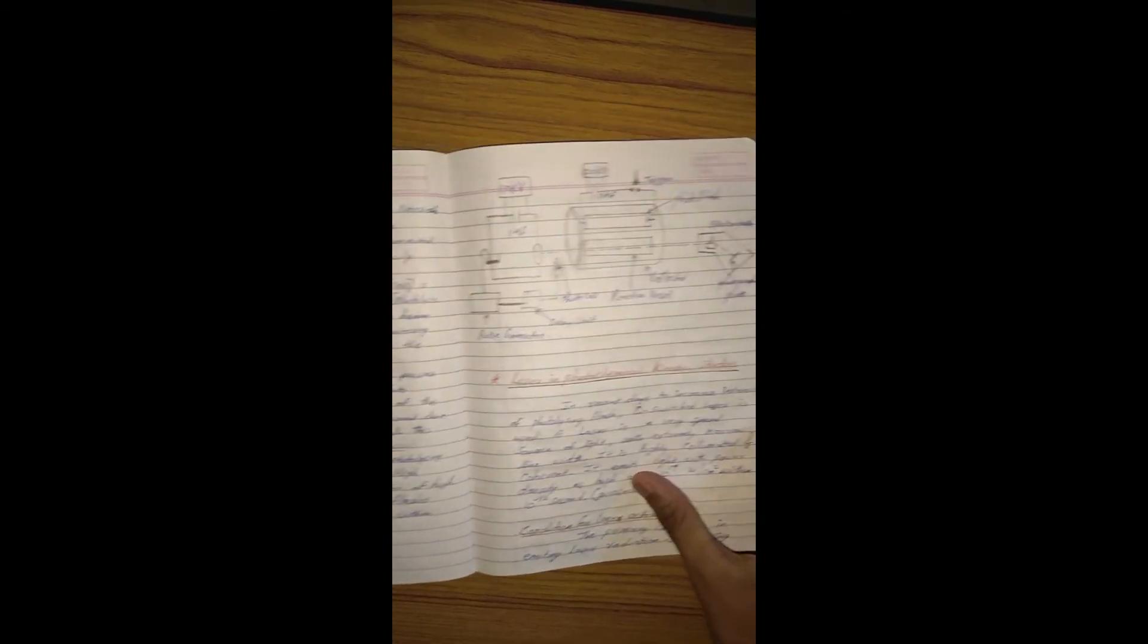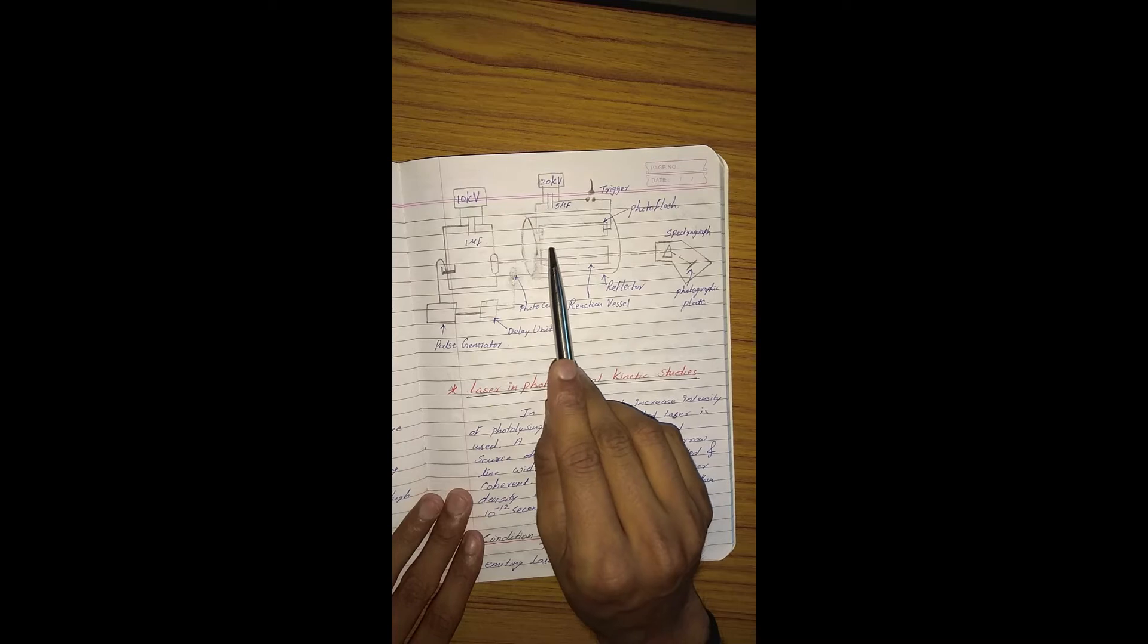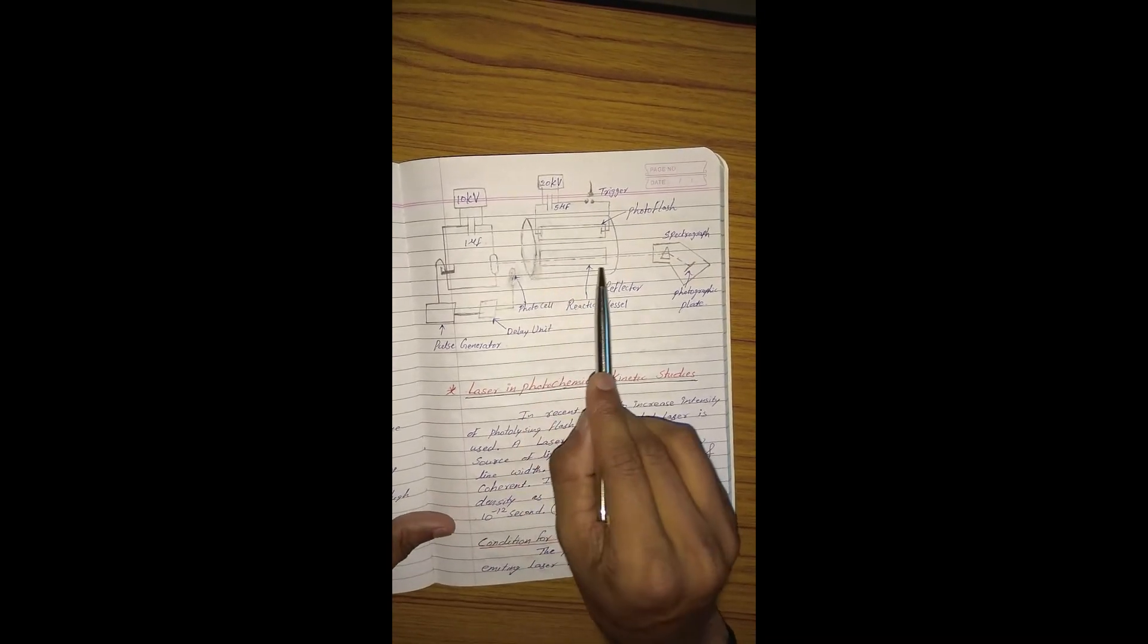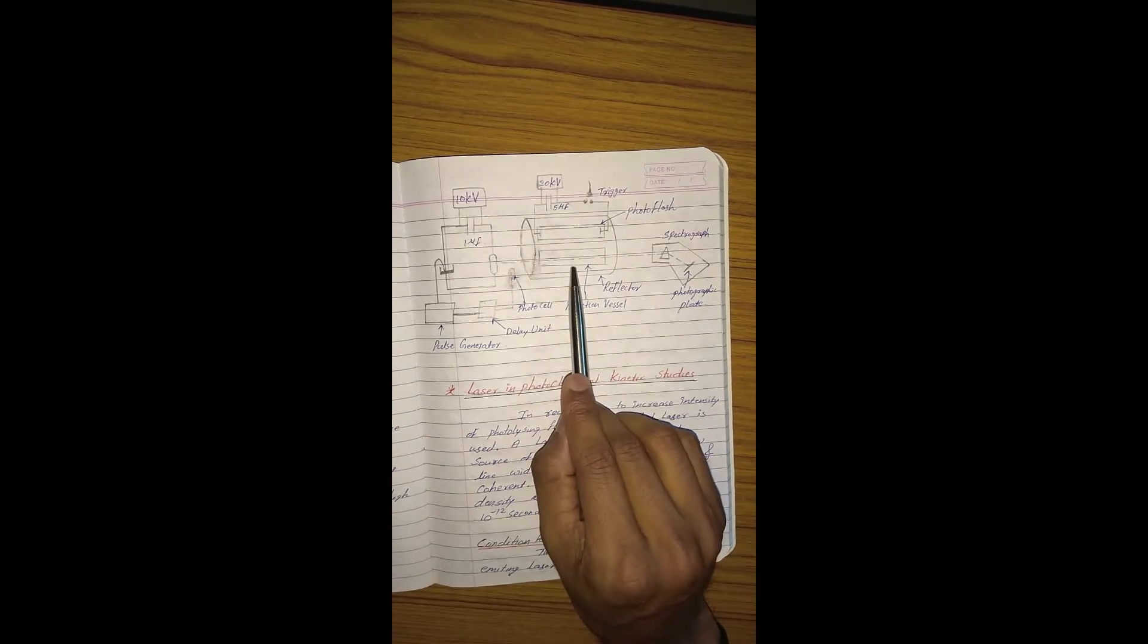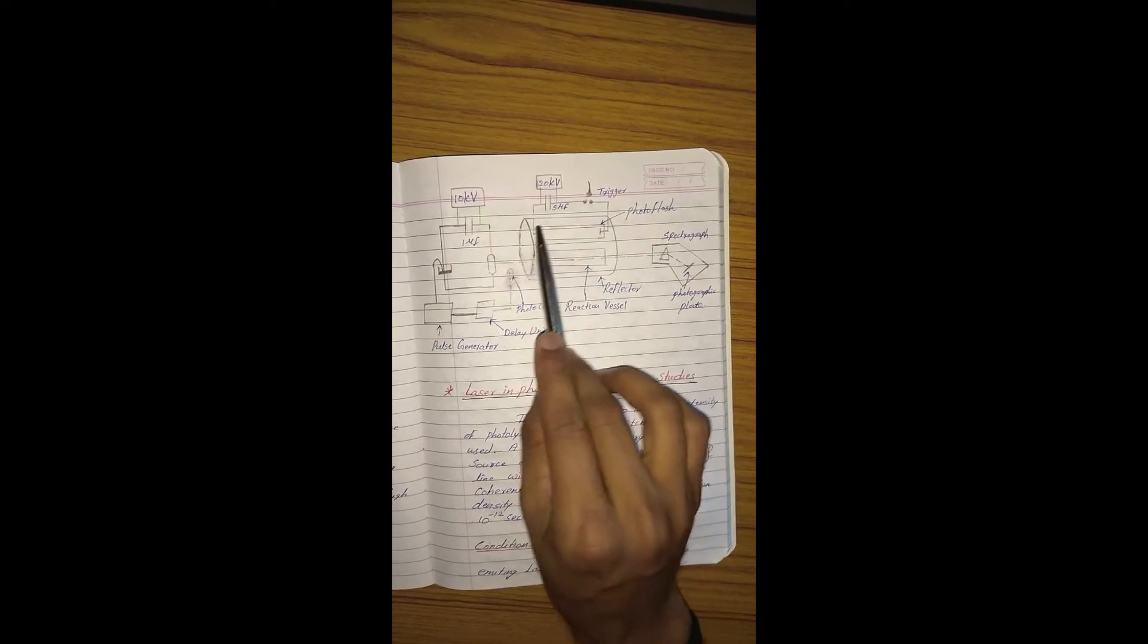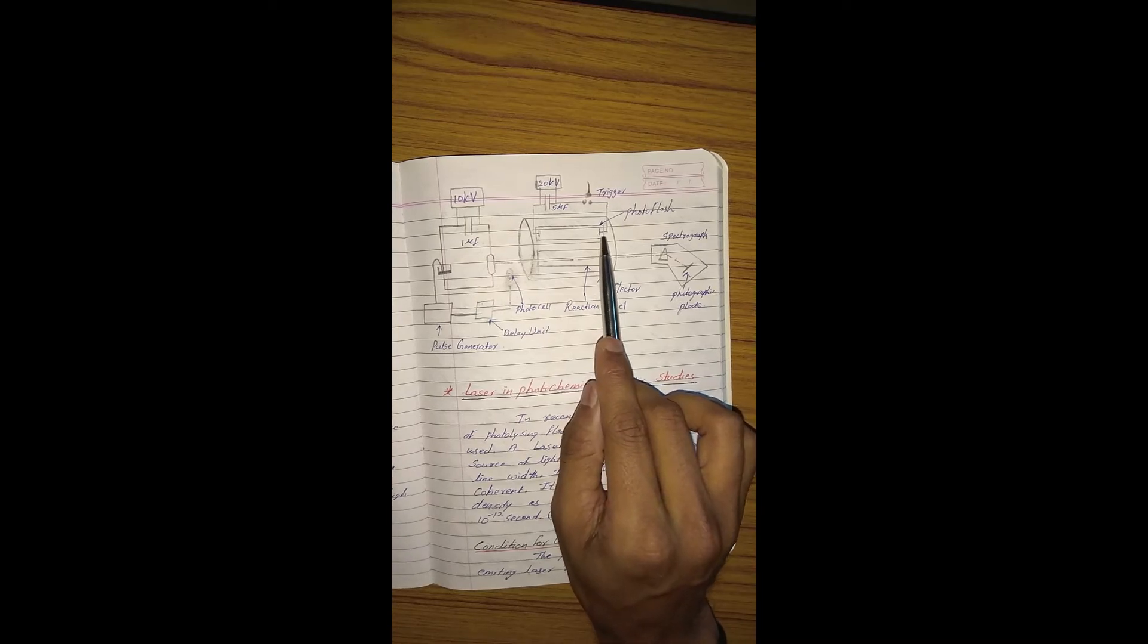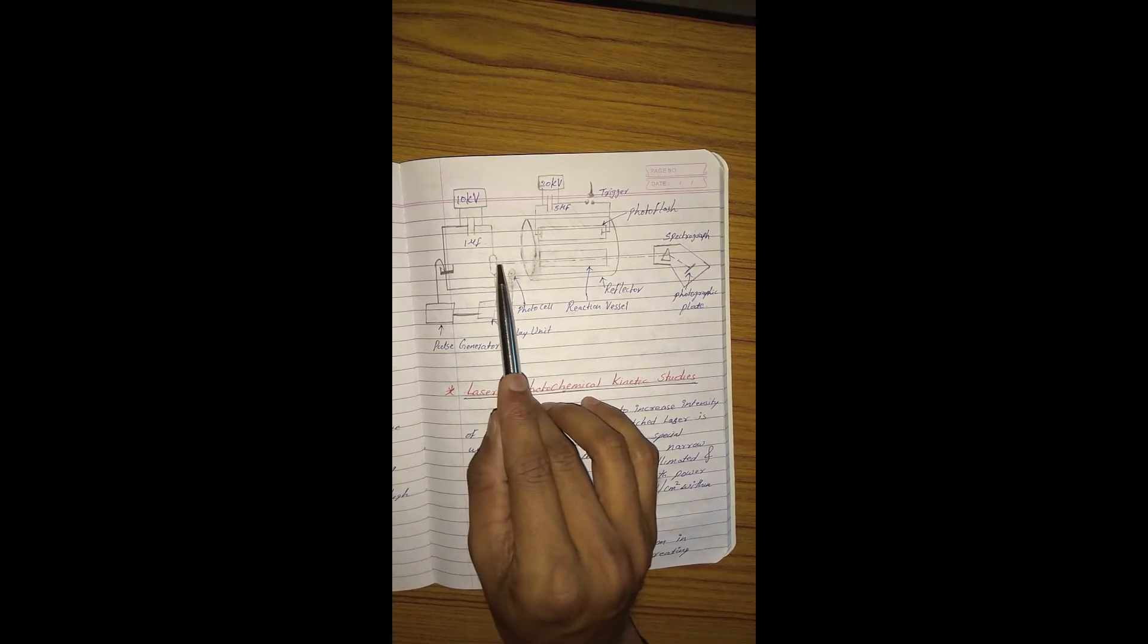In this particular reaction system, the reactions are taking place in what is called a cell. It is subjected to a high intensity flash. This flash is generated from this particular tube, and the reaction is monitored by using single beam absorption spectroscopy. It is somewhat like a colorimetric instrument.